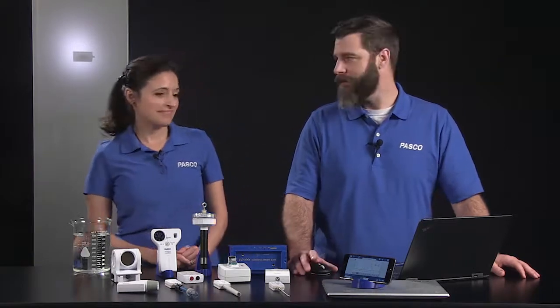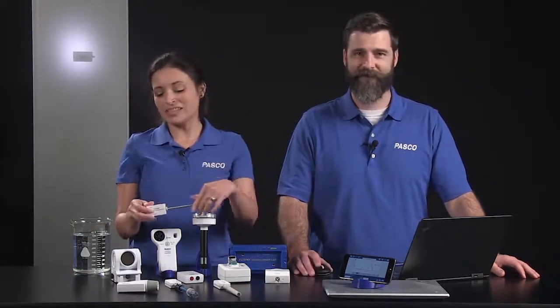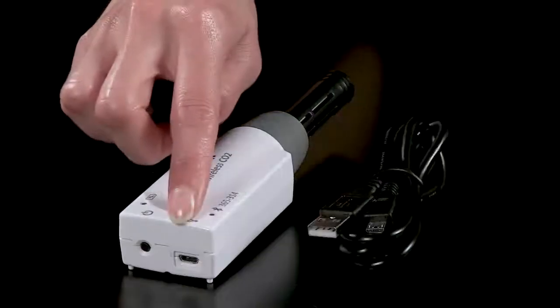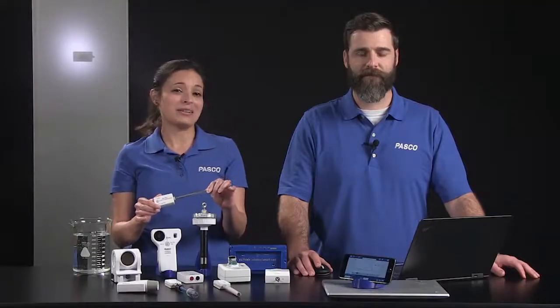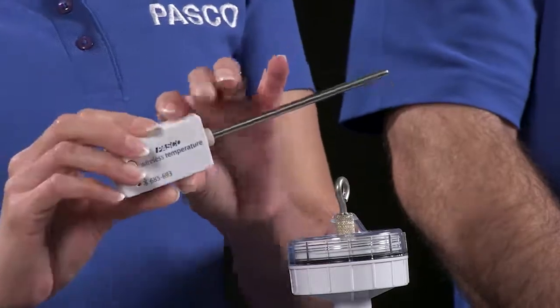Let's look at a wireless temperature sensor. This sensor has a coin cell battery. Other sensors with a USB port have a built-in rechargeable battery. All sensors are designed for long battery life — you can get more than a year's worth of battery life out of this sensor with average use.